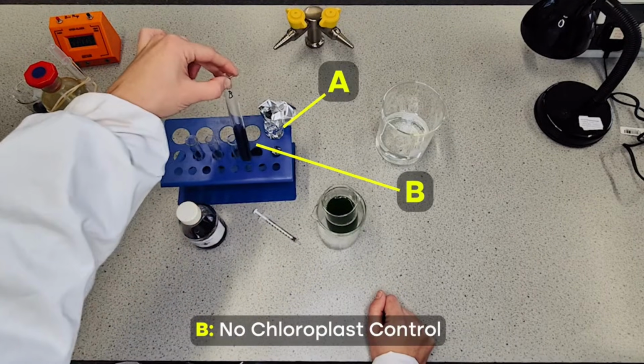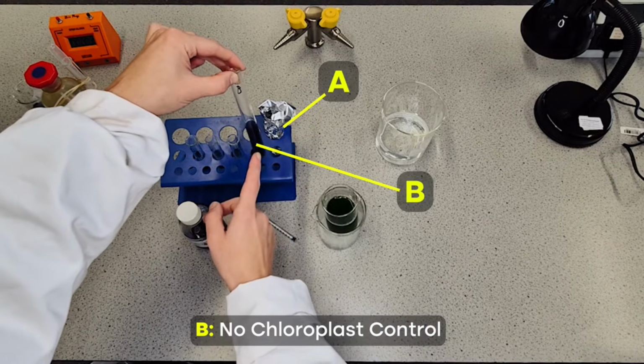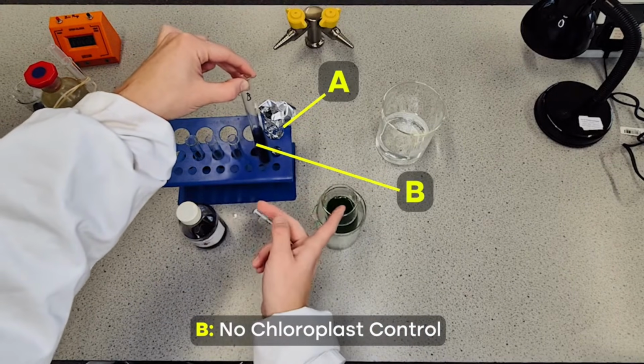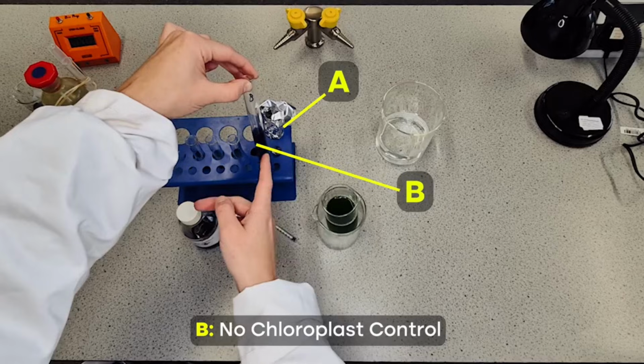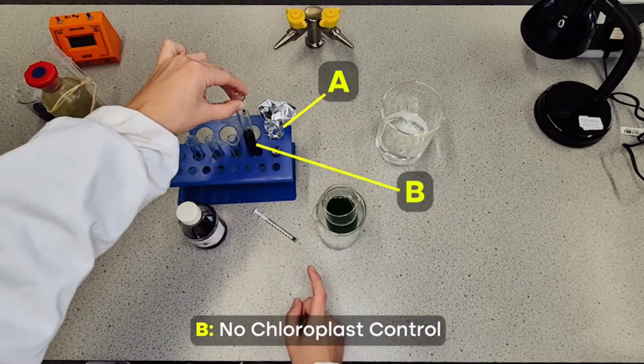Test tube B, this one here, we will have light going in, but I'm not going to add any chloroplasts to it. And if we don't have the chlorophyll present in those chloroplasts, there's nothing there to release the electrons for the DCPIP to pick up and to decolorize.